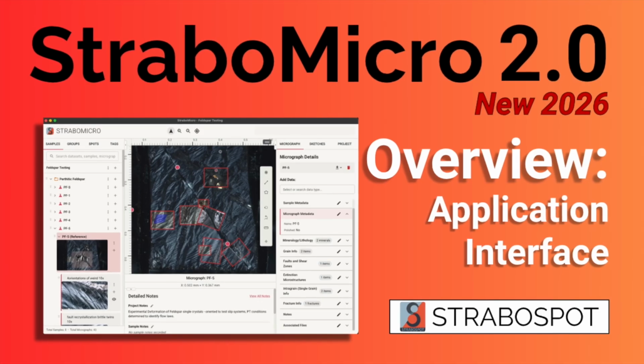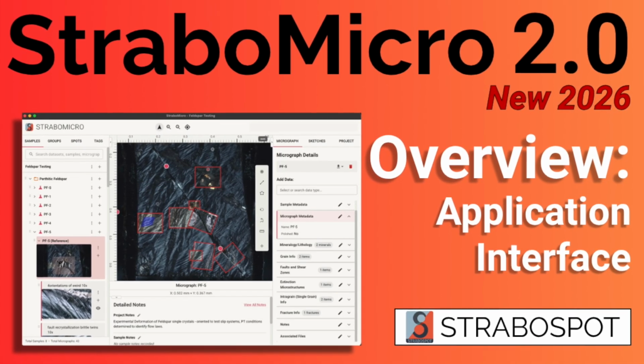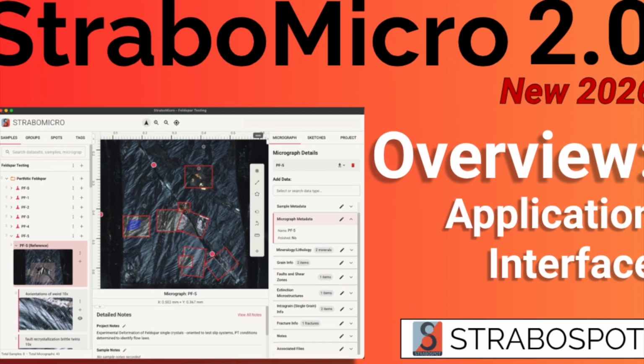And that wraps up today's tutorial on the overview of the StraboMicro application. In future videos, we'll cover some of the specific features, types of data, and tools that are built into the application.